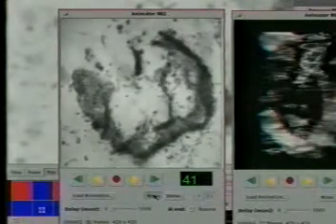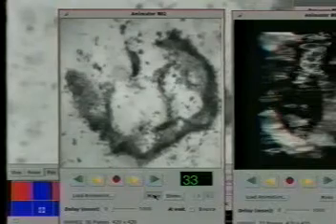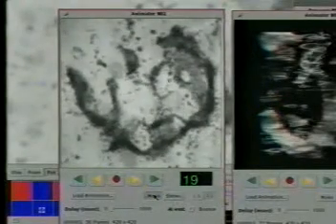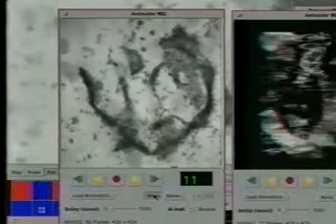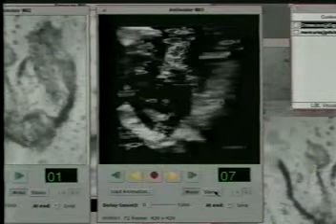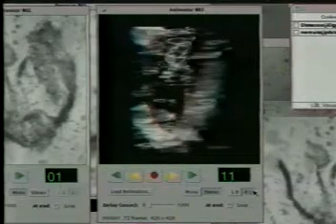We can then take that series of images at the different tilt intervals, and a software package called Supreme can create a volume of data from the tilt series. That volume can then be volume rendered, producing a 3D animation of the subcellular structure.